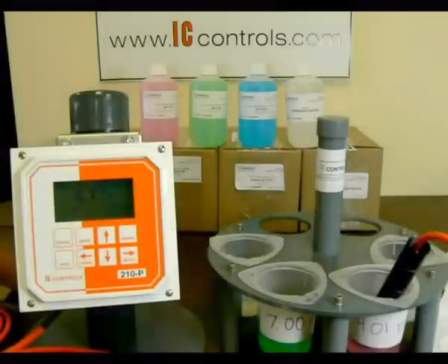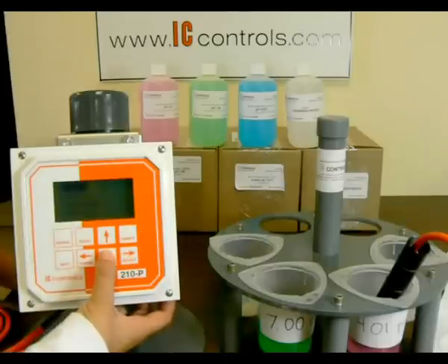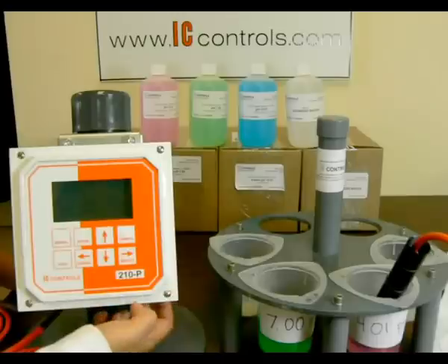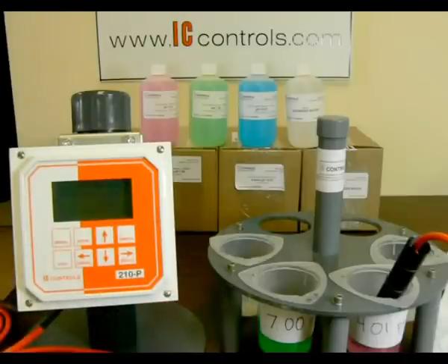Again, select pH, Calibrate, Buffer 2, 4 pH. Wait for the analyzer to accept the calibration and select sample. You should receive a reading of 4 pH.